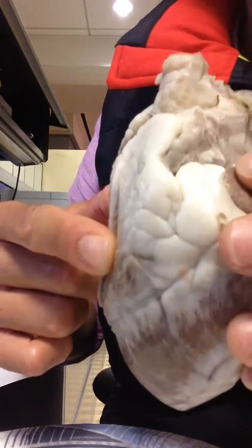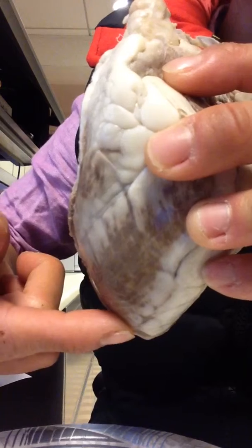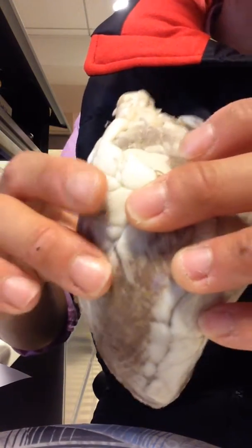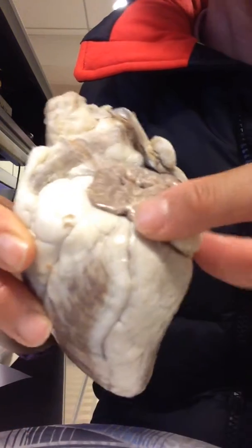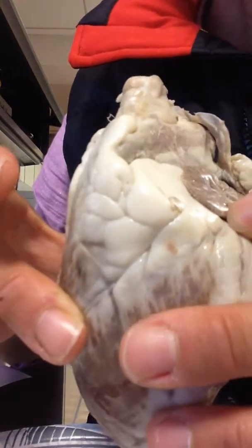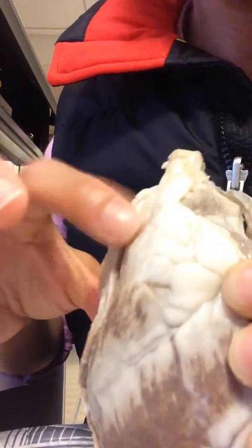And then number two, the apex of the heart. Apex of the heart. And then number three, the right and left atria. So the left atria is here, right here. Sorry, this is the left atria. And then the right atria is on this side.